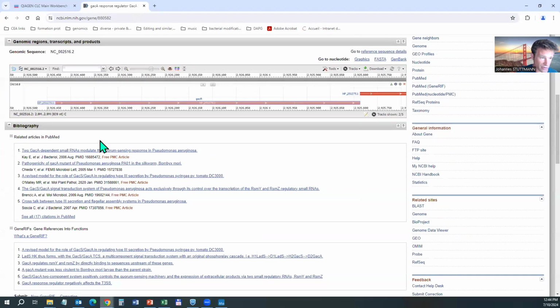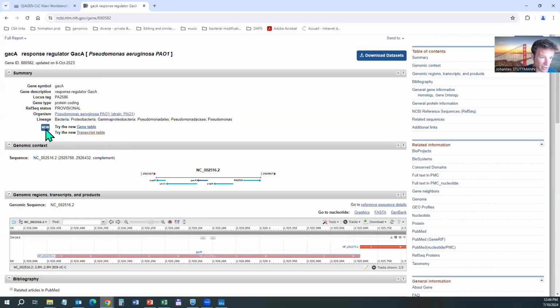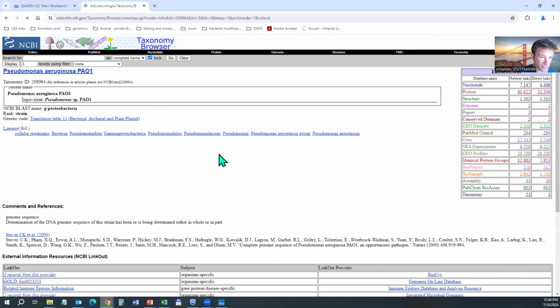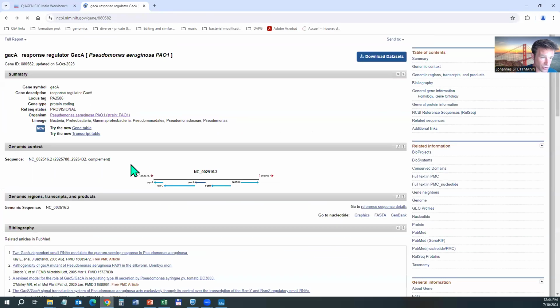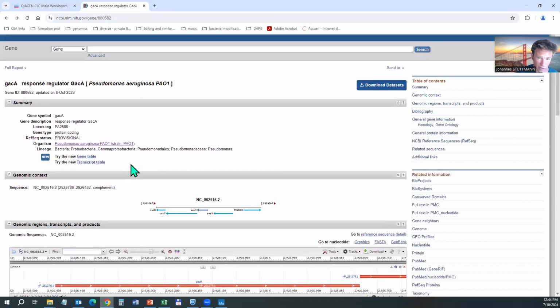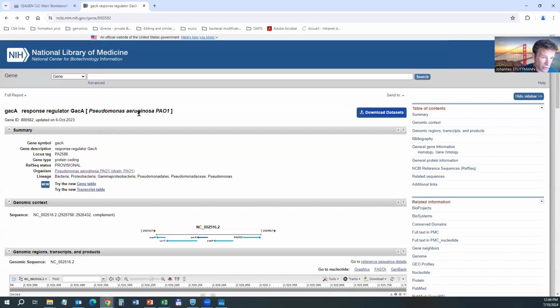And we have a number of different things. We can also from here come to the strain. So here we would have the full strain and the full genome somewhere. I actually don't know where exactly we have it right now. So normally, this is now an entry for a DNA file.